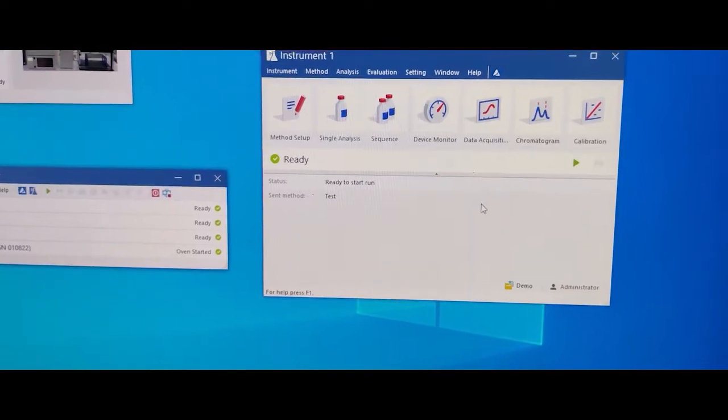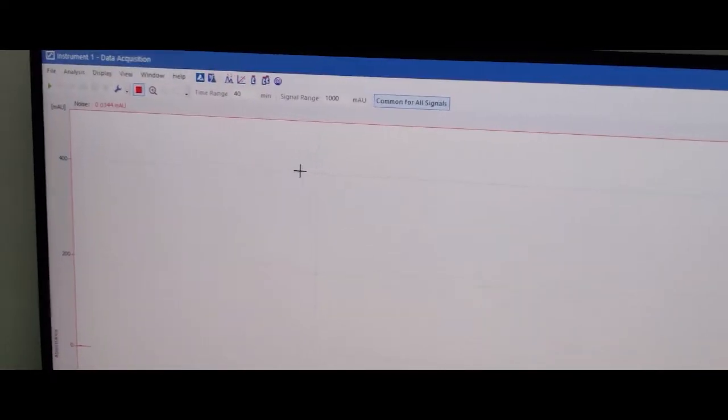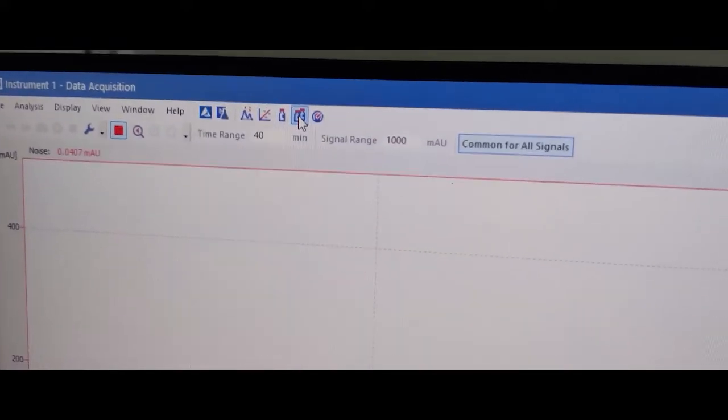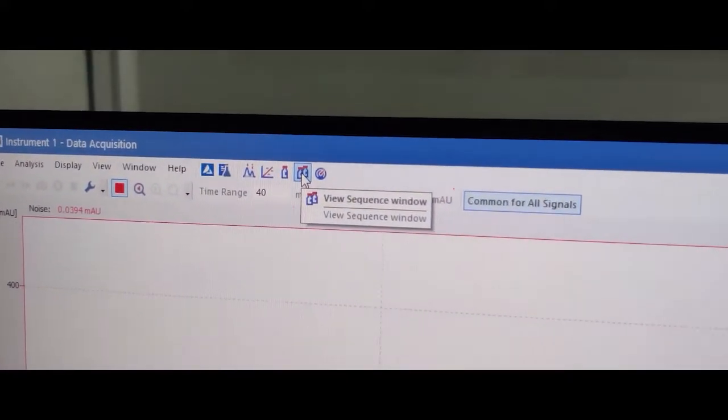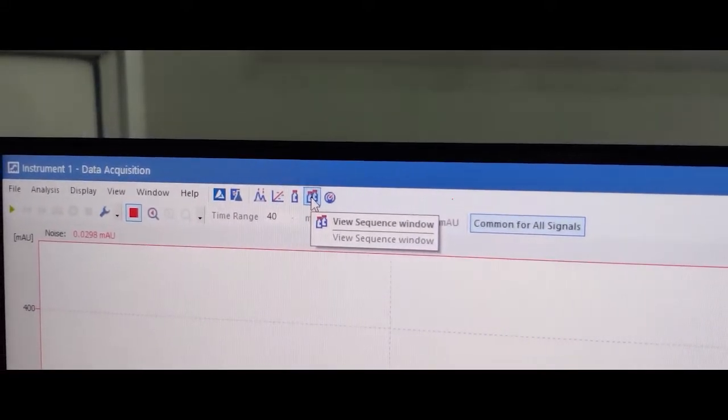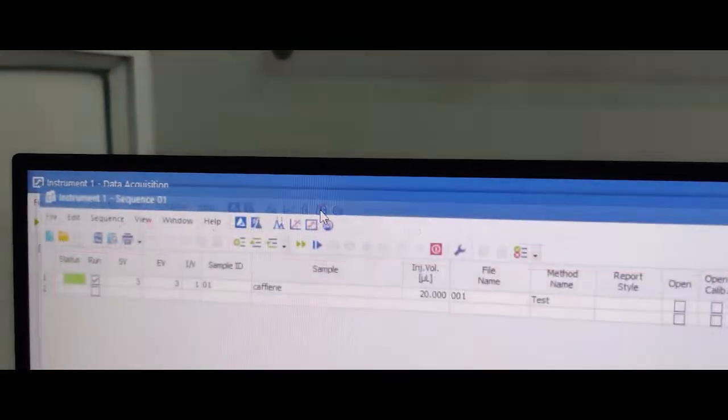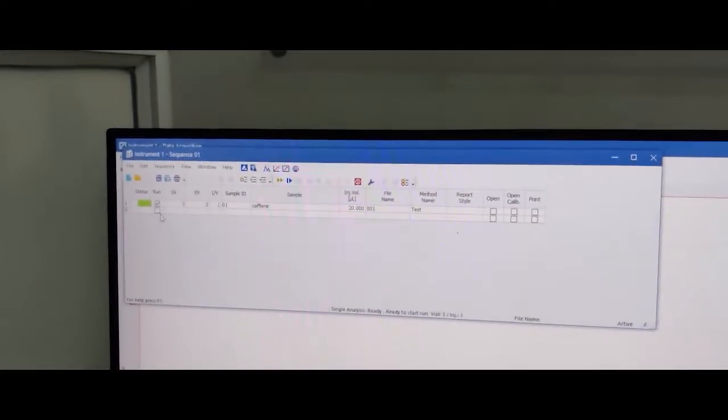The data acquisition window for checking the baseline. You can see the baseline. Now we make the sequence for the sample run. So click the view, check sequence window, fill up.